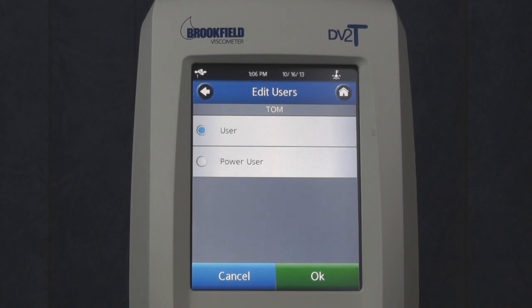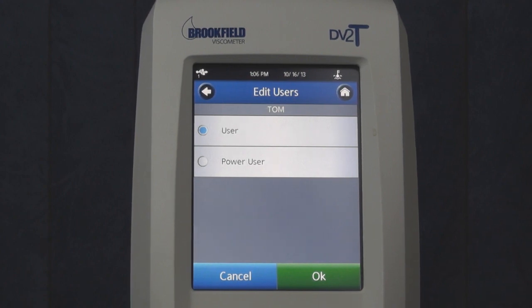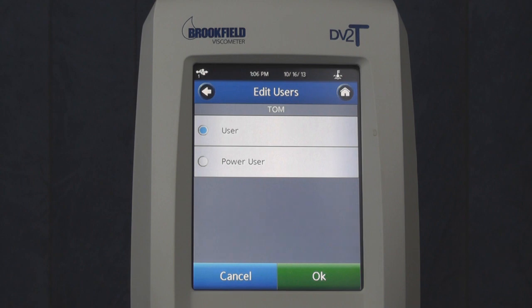Choose whether the new user will have User or Power User access. For a list of the factory default user settings, please see the Users and Access section in the operating instructions provided with your instrument.